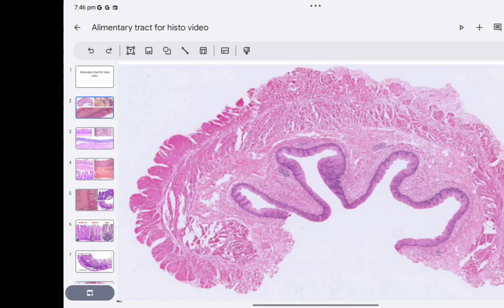Students, I often find that you people confuse identifying different parts of the alimentary canal. Now, as you know, the alimentary canal has a lumen inside. So this is a cut section. I have taken a slide with a section of the alimentary tract with a folded lumen inside, and I will go on describing the basic layers of the alimentary tract all along.